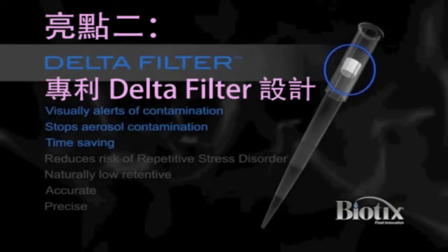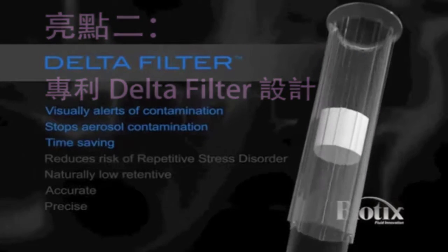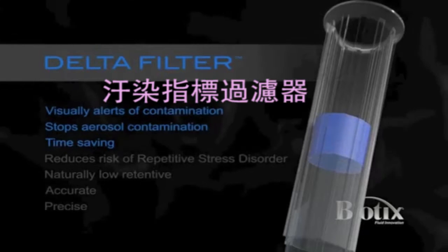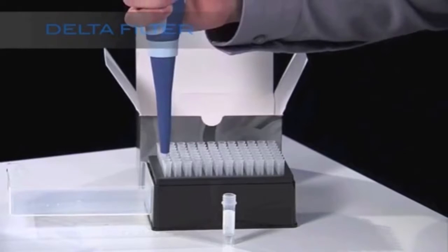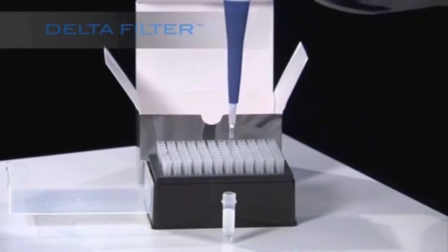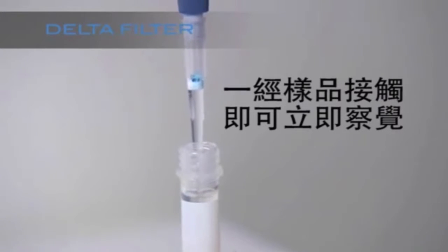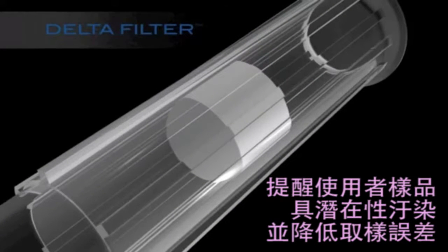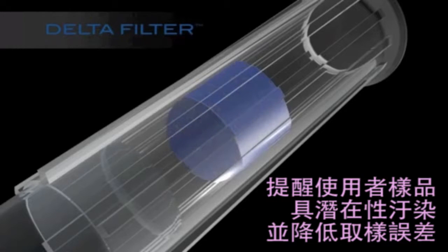Delta filter — a patent-pending tip filter that alerts the user of potential sample contamination. This is the first filter that provides visual indication that contamination has occurred.